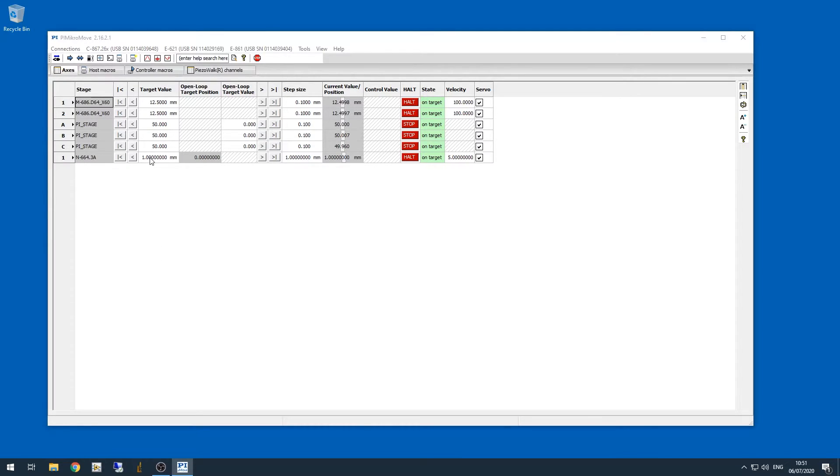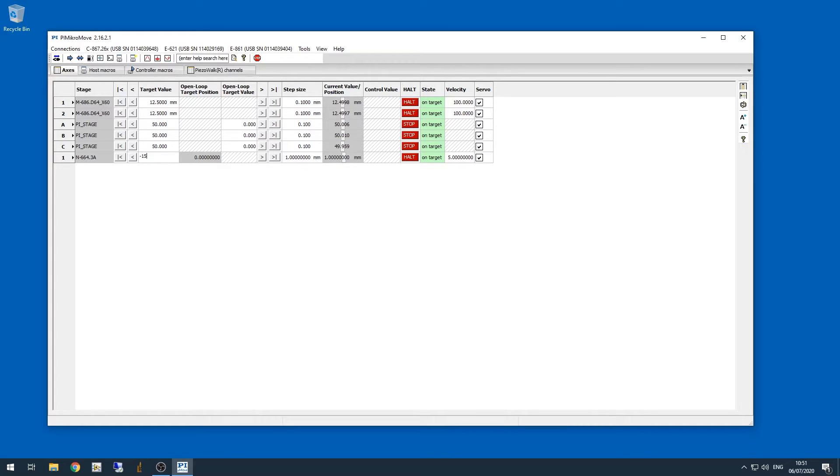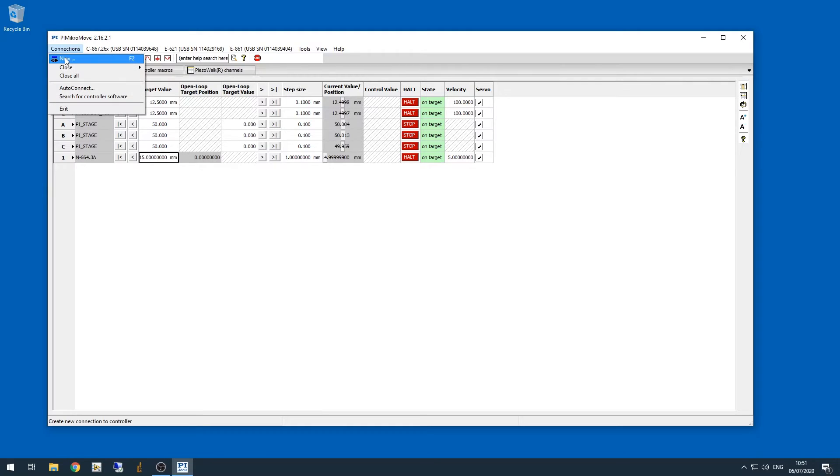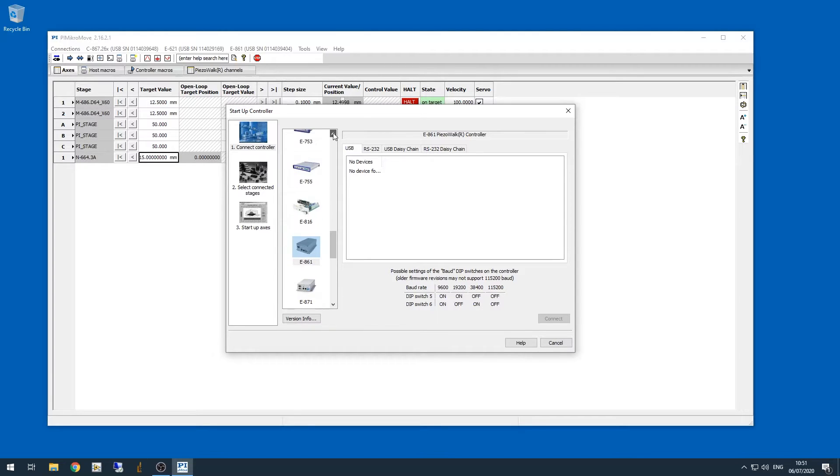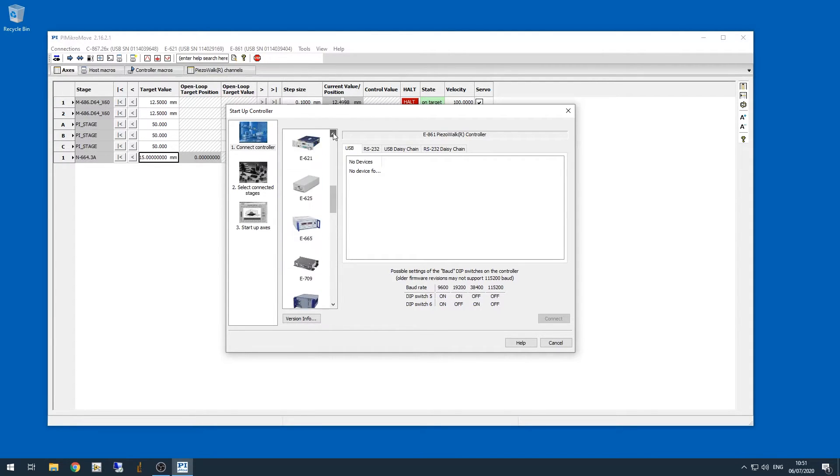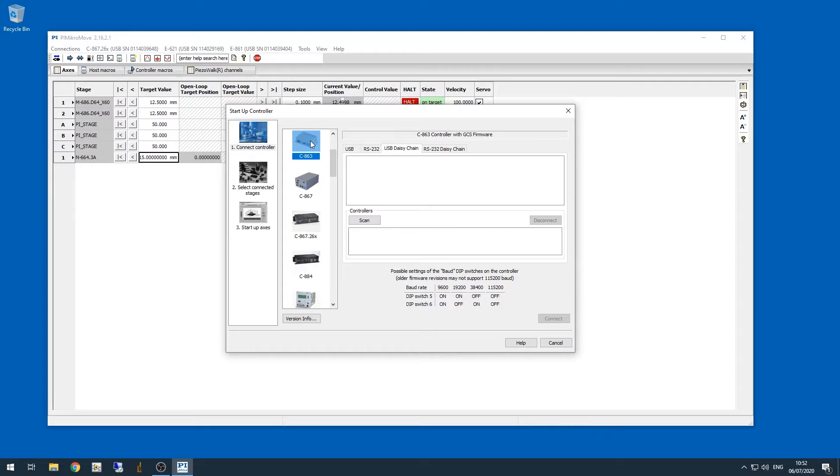Now on this system, when the upper objective is fully retracted for sample loading, the upper objective Z stage should be at minus 15 millimeters, so I'm moving the stage to that position now. And now we need to connect to the DC mic motors that control the sample coarse Z position. This is the connection that's a little different. We need to look in the list and find this C863 controller. There it is.